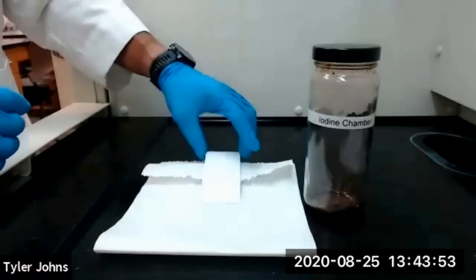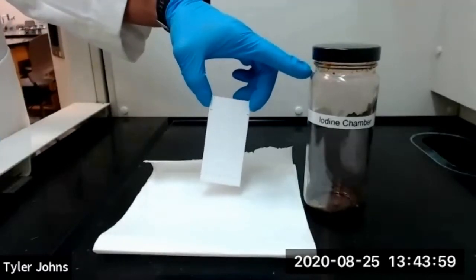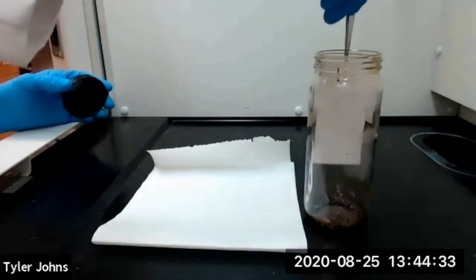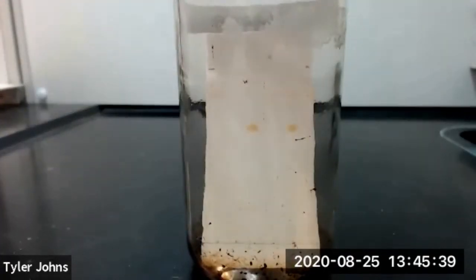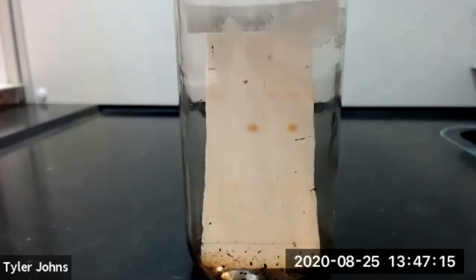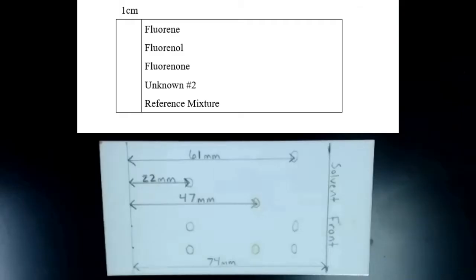Once our TLC plate has completely dried, we'll place it in an iodine chamber until the spots begin to appear. This is our fully developed TLC plate. You can now calculate the RF values for each of our three compounds and also identify the compound or compounds that were in our unknown mixture. This concludes part A of this experiment.